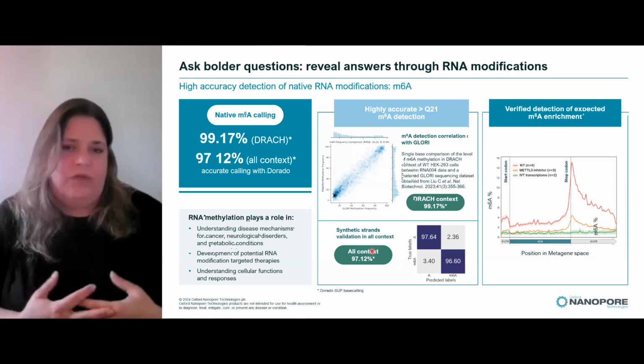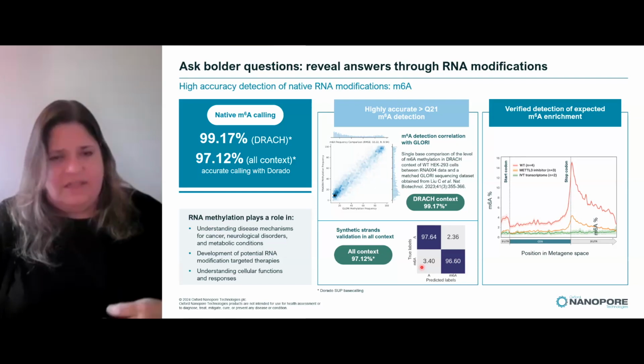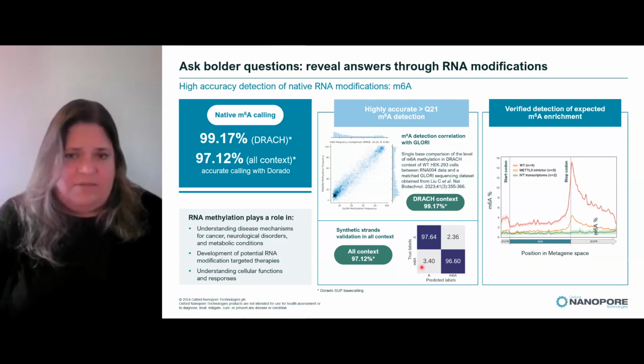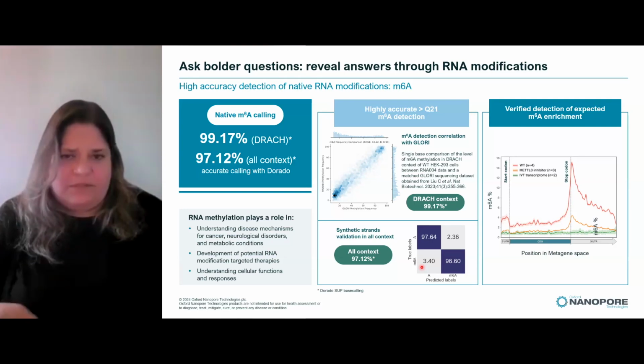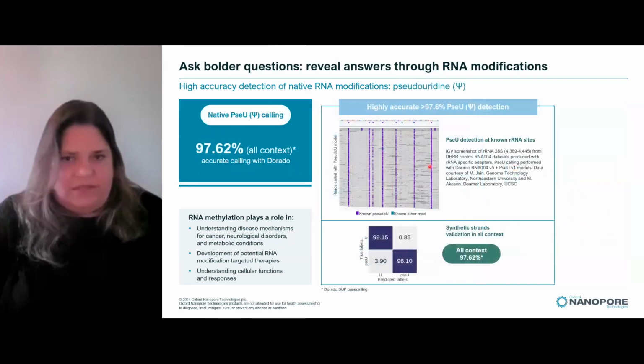So it's a whole new way of being able to identify things that have implications in things like understanding cellular functions, looking at the differences between how things are translated, different isoforms that are being utilized, different perturbations when it comes to cancer usage for drug therapies, or even whether or not something has metastasized and become cancerous versus whether it's been modified before that when it was non-cancerous. So we have the ability to look at different modifications quite accurately with these different base calling models.